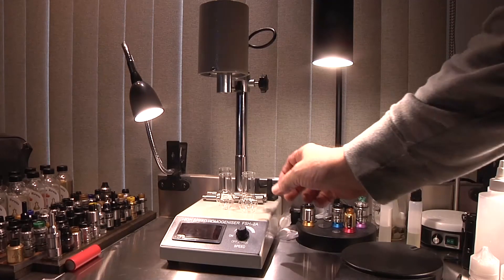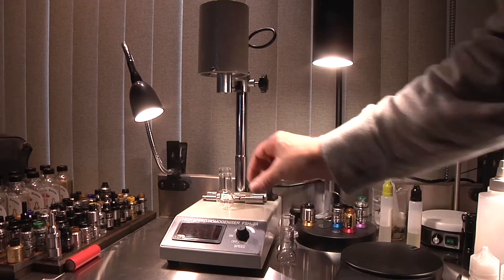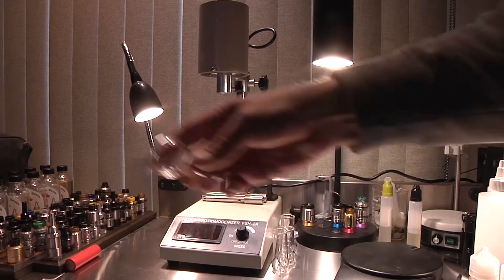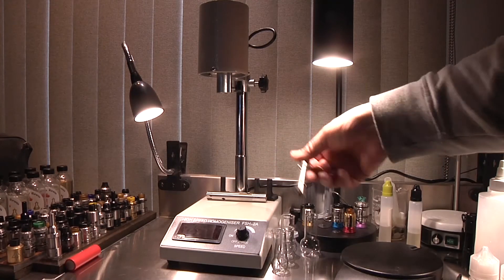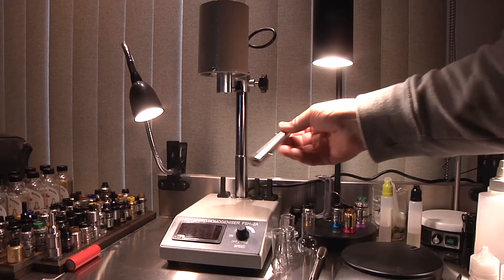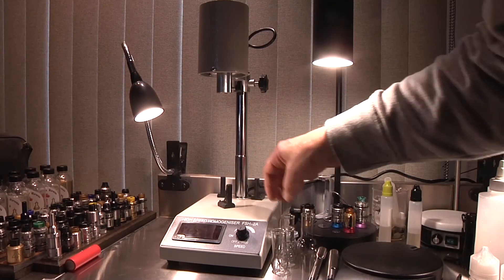Here's the unit with everything it comes with. We get four small glass vials for mixing. We get two probes — a small one and a larger one. I kind of like these little holders for the vials.